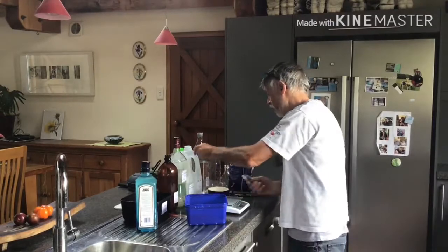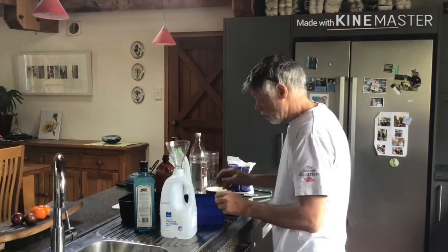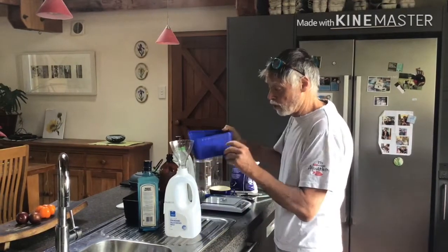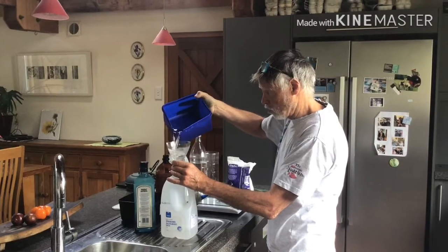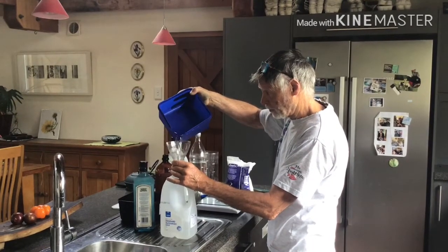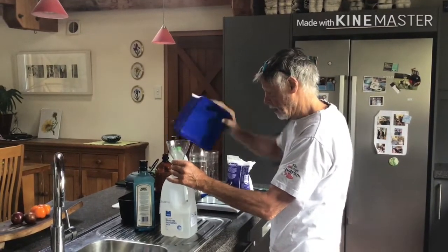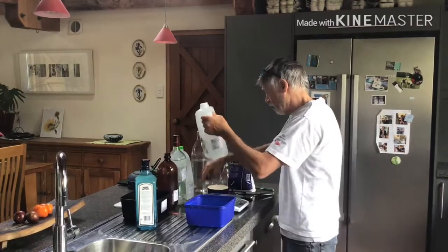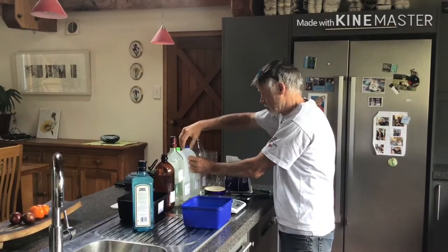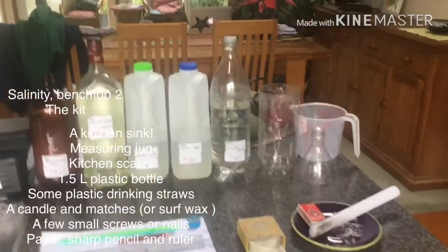And here, this is where we use our funnel. Do this over the sink. So our little homemade funnel works really well. We can just pour it in and we can store these solutions. And we're all set to go. Well, there's certainly an ocean in the house now.